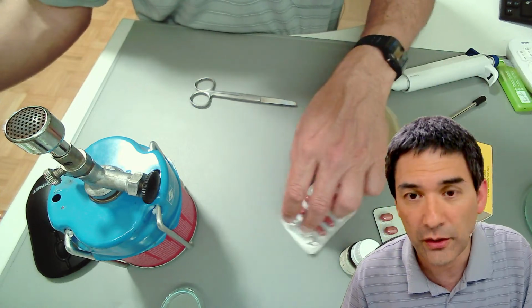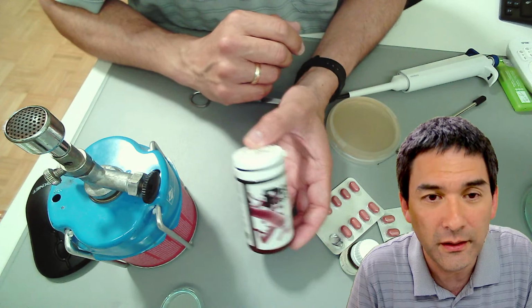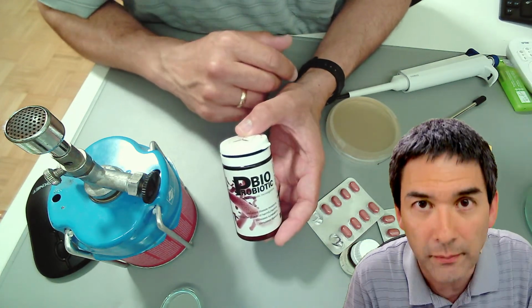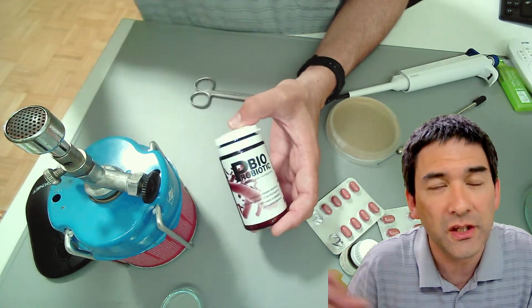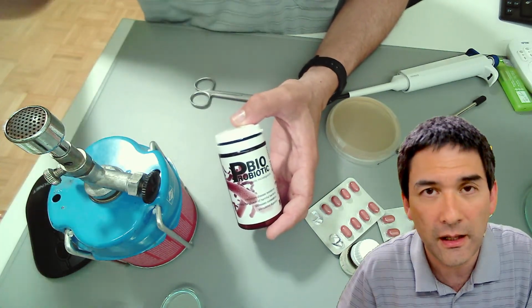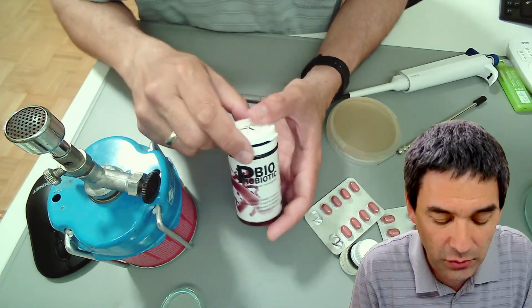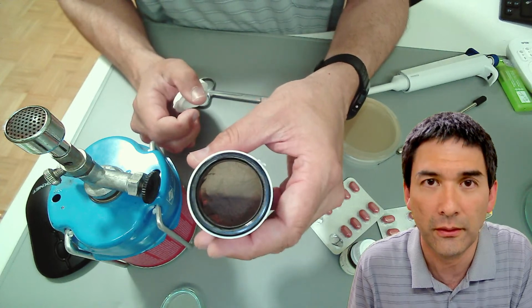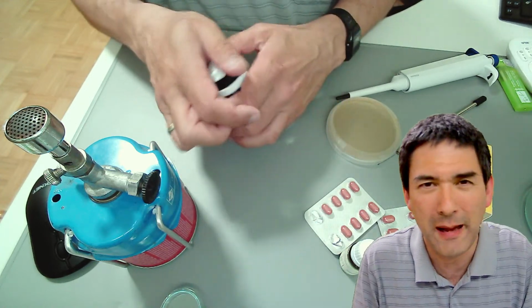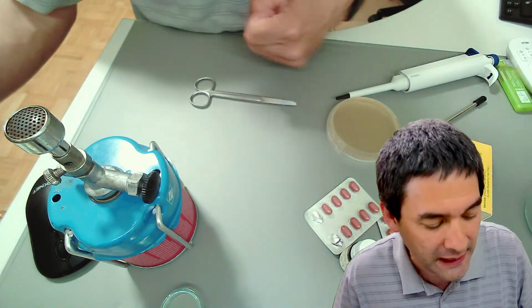And something I didn't even know: a co-worker who's got aquariums gave this to me. These are bacteria that you can add to an aquarium, called probiotic bacteria for fish, because aquariums also need certain bacteria in there, and you can add those as well. If you look into it, it looks like powder, and it smells pretty bad. So I just wanted to show you that bacteria can be bought.